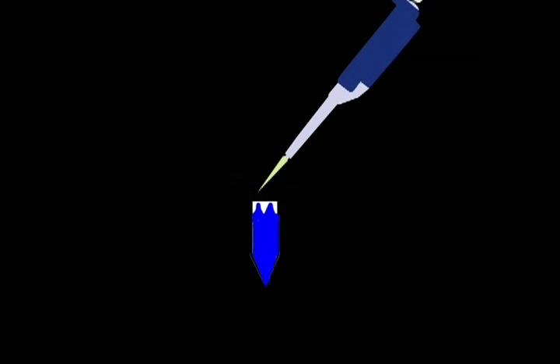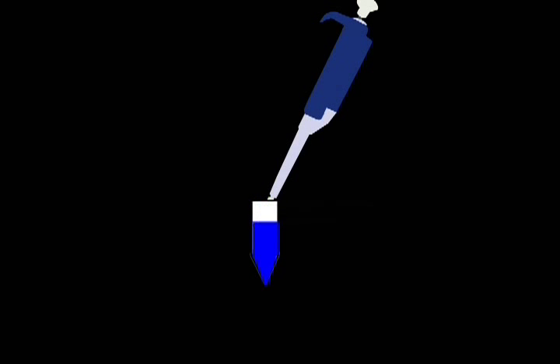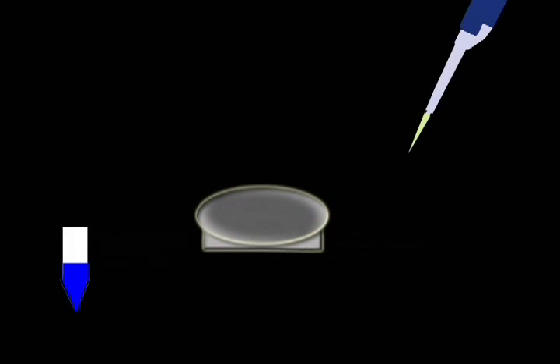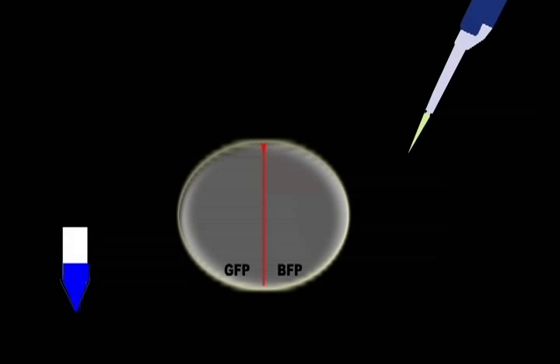Now we are going to be plating our cells. First, you will use a sterile 1 microliter pipette to transfer transformed cells from the tube. Before you place it on your plate, make sure you labeled the plate and drew a line dividing the plate in the middle.